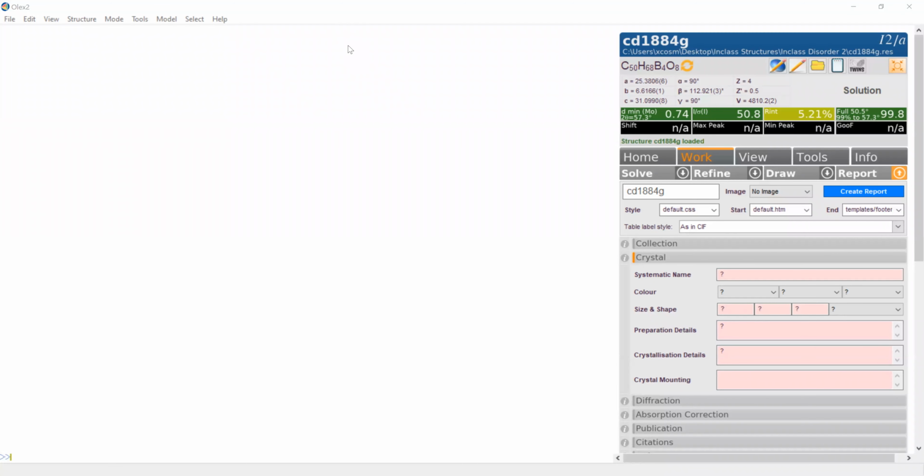One thing you may notice is that the space group is I2/a. We'll go with this space group for now, but maybe when we do a checkCIF, it may suggest it's a C-centered. So I2/a and C2/c. You know, if it's I-centered, you can actually convert it to C-centered as well. And so for now, we'll deal with the I2/a and then see if checkCIF denotes any additional symmetry.